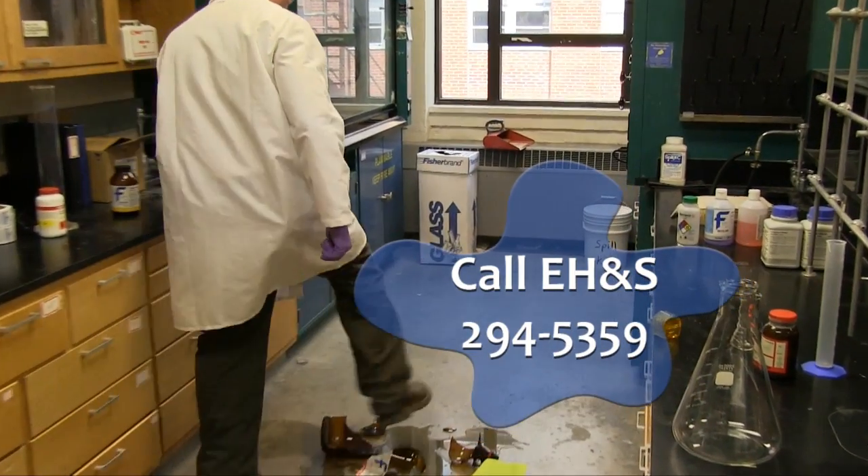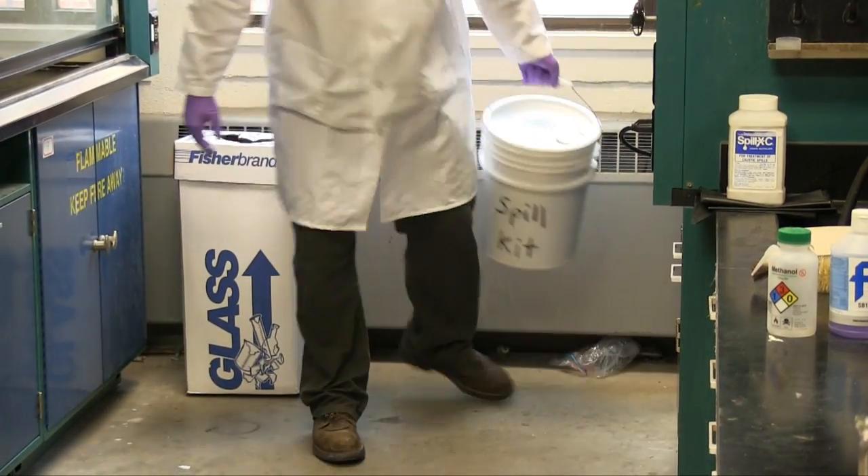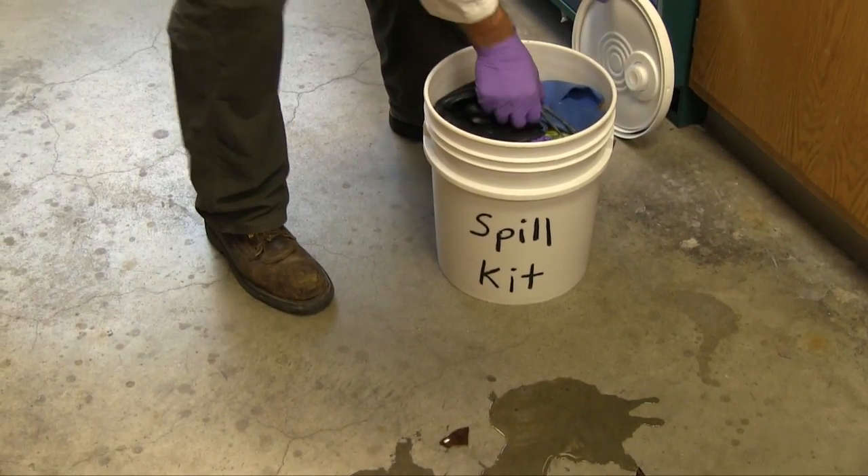Please contact EH&S at 294-5359 if you don't feel comfortable addressing the spill on your own. First, retrieve a spill kit.